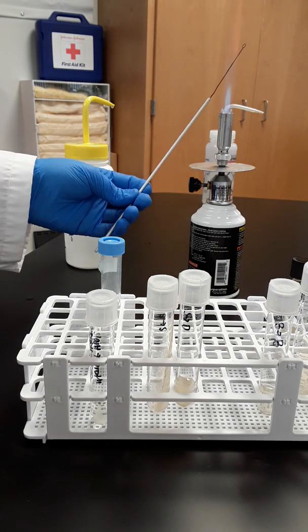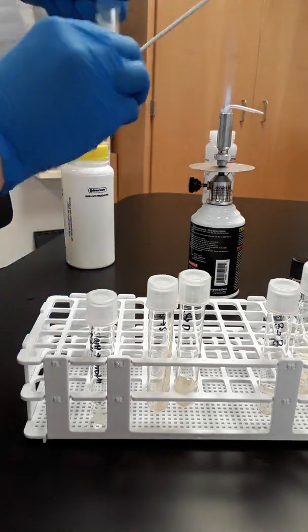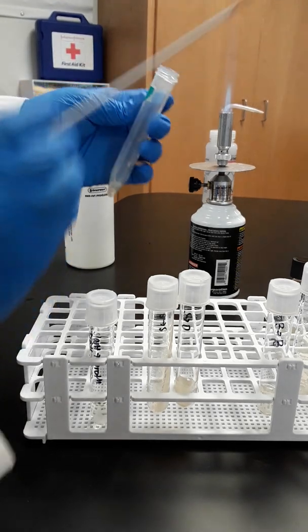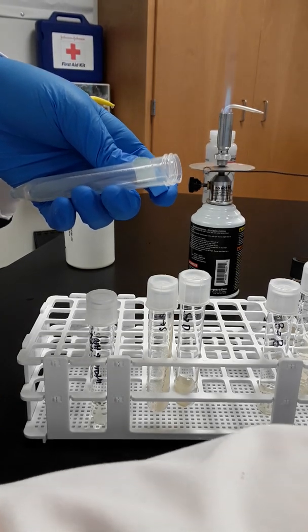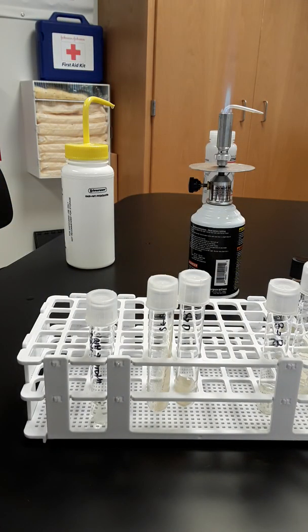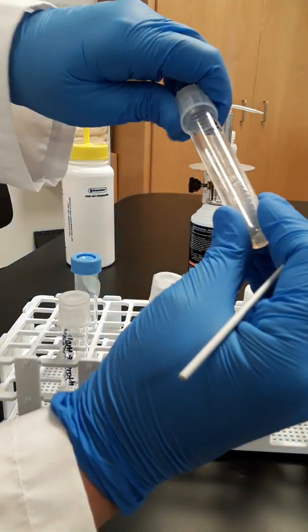Then we're going to do that the same way, slant to slant. So we're going to sterilely transfer from the slant again. Whenever you open it, flame, flame. Did I do that for the slant to broth? I don't know. Whatever. So then we're going to insert after 20 seconds. We're going to pull a little bit off, just like you're drawing on Jell-O. You're just picking up one cell, which is all it takes, which is kind of creepy because that's all it takes to contaminate a patient as well.